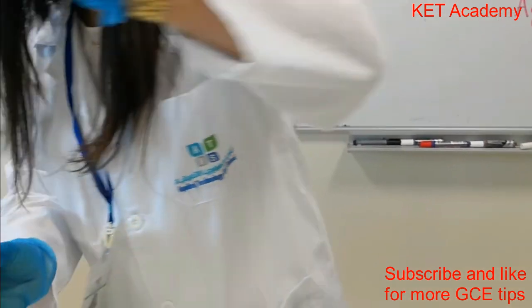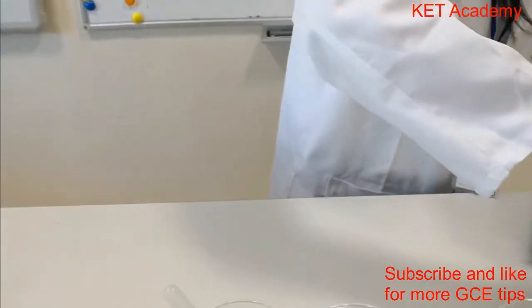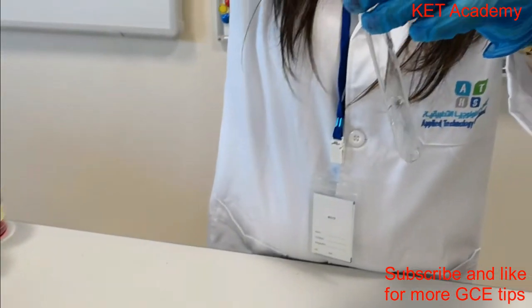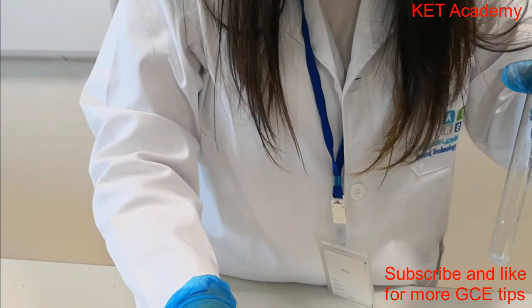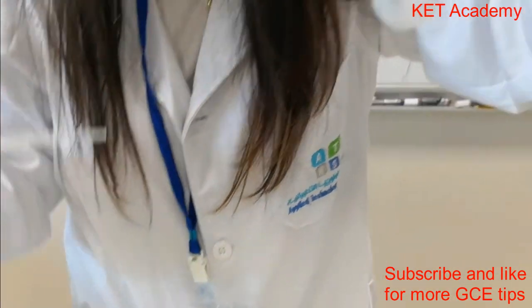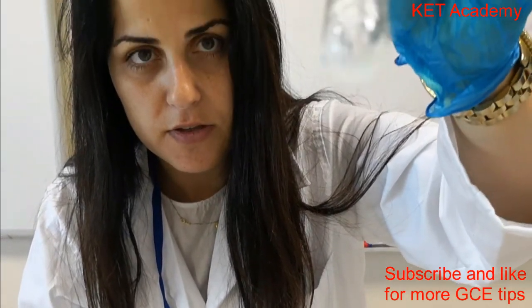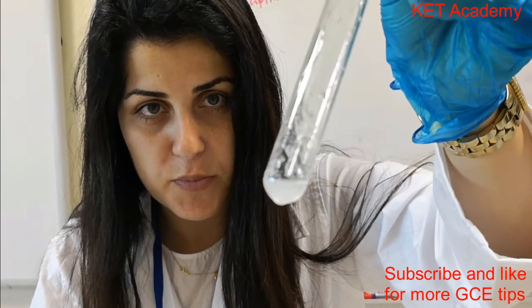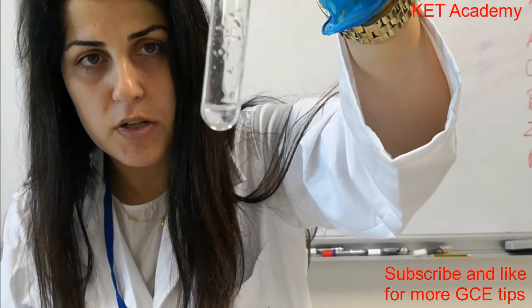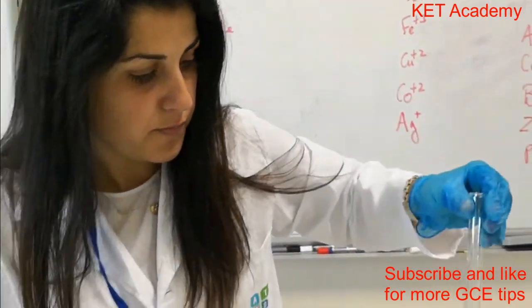I can repeat this slowly to show you the white precipitate. This is zinc, and I will add a few drops of sodium hydroxide. You see, this is a white precipitate. Now if I add more, it will redissolve.